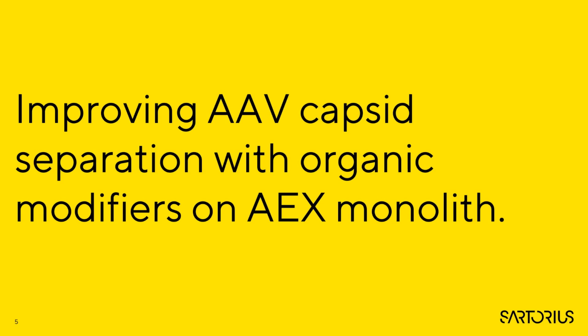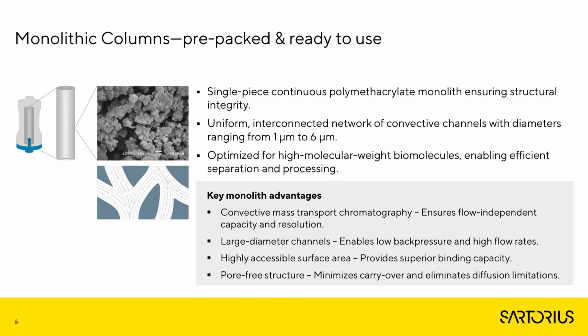The improvement of AAV capsid separation was developed on strong anion exchange monolithic columns. Just a few words about monolithic columns and why they are optimized for purification and for the analytics of large biomolecules. Monolithic columns are produced as a single piece of polymethacrylate monolith material.